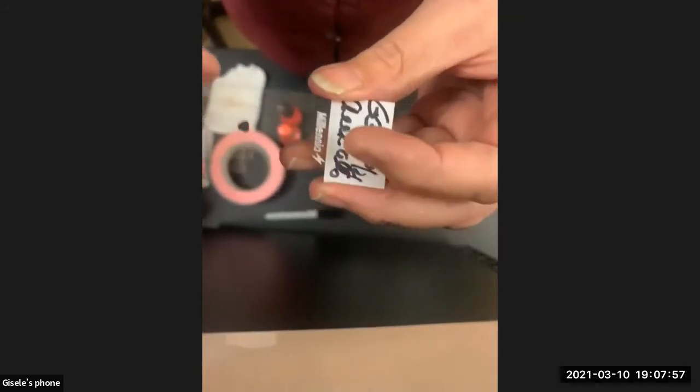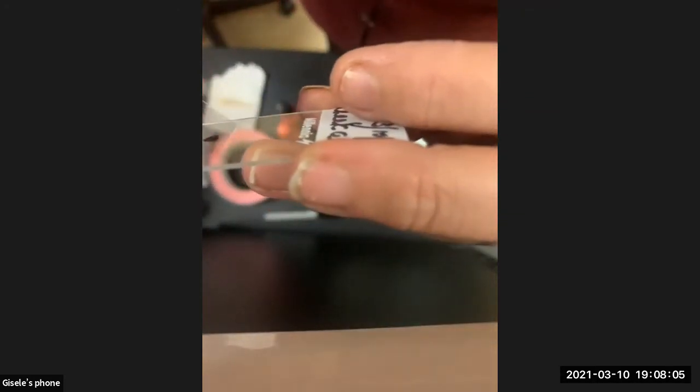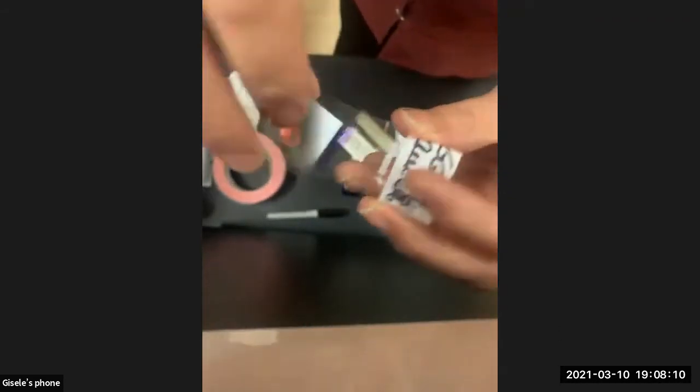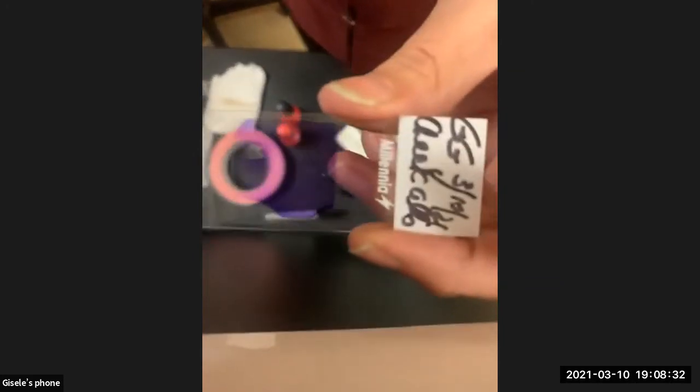And then how do you put them on? You want to put them on so that you don't get bubbles. And so the best way, let's see if I can do this safely with the methylene blue, I'm not sure it's really showing up in the video, but you want to basically put it at a 45 degree angle and then let it go down and just drop onto the slide and let the fluid go under. And I almost put too little. You would have cheek cells, so you'd have some fluid, but you basically want something like that. And if there's just a little bit of fluid, it's already going to form its own tight seal.